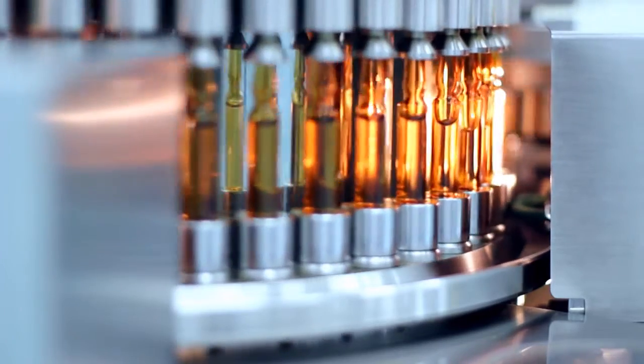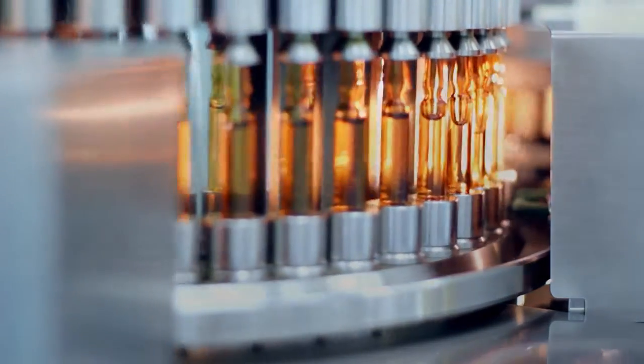Pharmaceutical life science cleanrooms, like those used for aseptic processing, are designed to keep contamination away from critical areas.